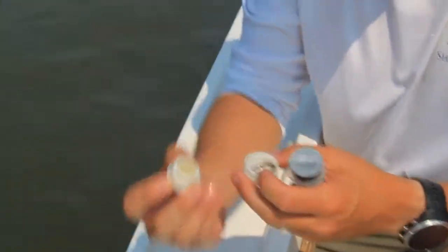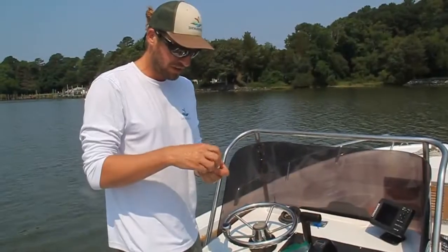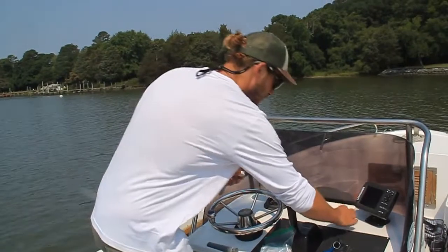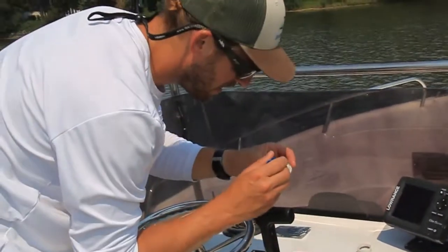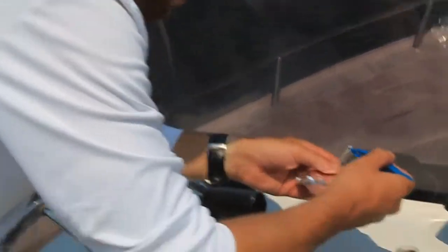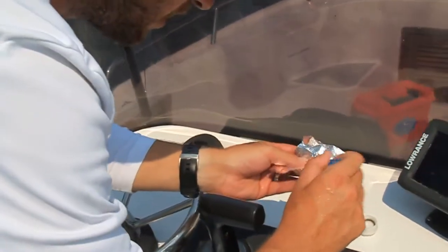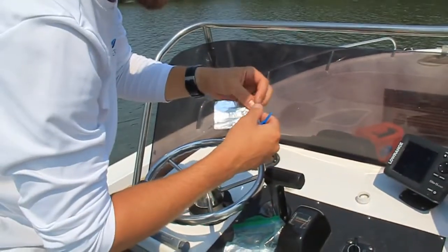take off the capsule and you'll see all the material that we have that the lab will be able to analyze. Prepare this filter here to send it to the lab. And so what we do is we take the capsule apart, and with our tweezers here, we want to take the filter off. You want to do it as smoothly as you can. Take it here and put it in this tin foil. And you place it on the fold there, and you want to fold it on itself like that so it preserves that material that we collected.